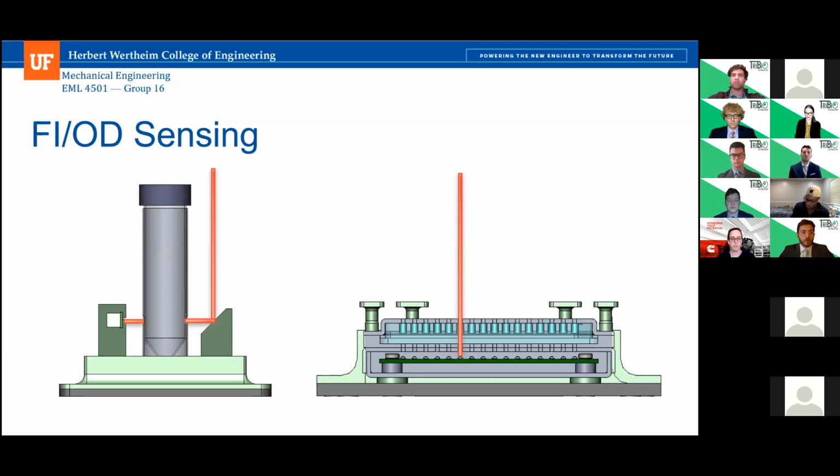So depending on whether it's 6 or 384 in that range, the photodiodes are going to be able to receive the laser intensity from our laser. Laser 2 is a 640 nanometer laser, so it's red, and it's located at the bottom of our z-axis. We'll go into a little more detail in our analysis about maintaining the intensity needed to calculate optical density based on our customer requirements.